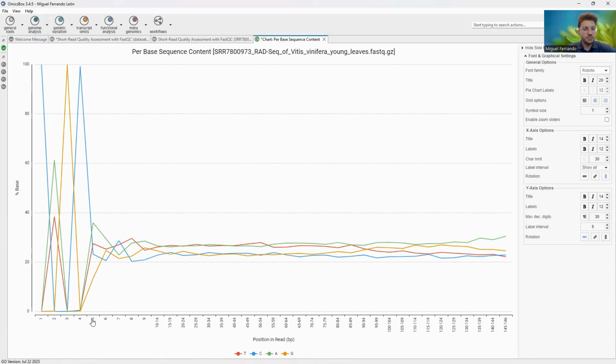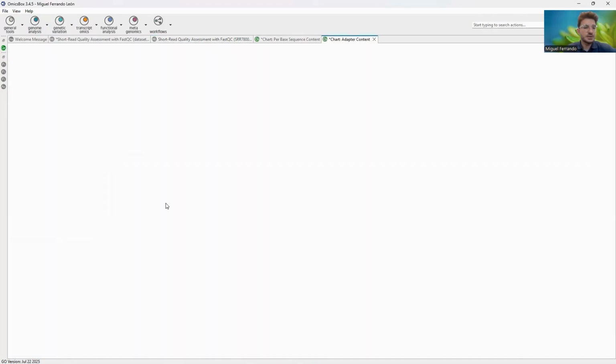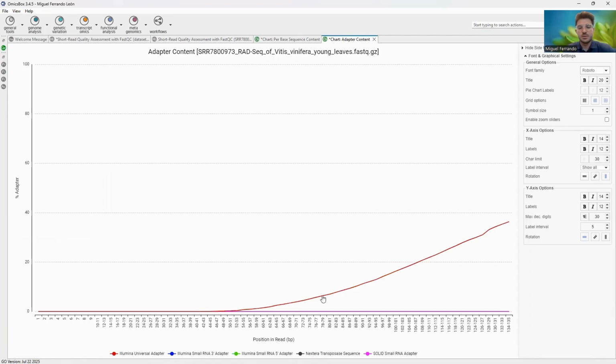So we will trim sequences by position at this specific position, and then if we go back to the report and click on adapter content details, we can see that in fact we have an Illumina adapter present in our sequences. We check the position, and we are gonna cut this right here and remove both adapters and low quality bases through pre-processing with Trimmomatic.